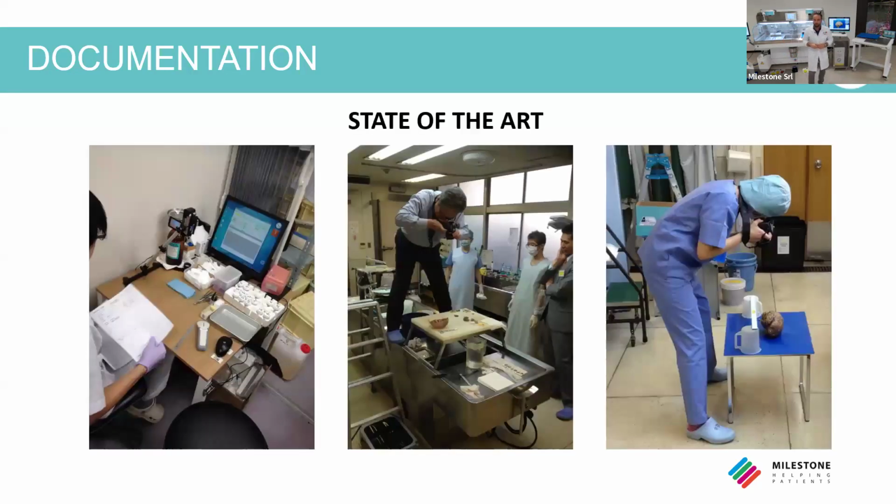Those images show how documentation is done nowadays. The first image is an operator taking pictures of biopsies, not a standardized and not a comfortable solution.